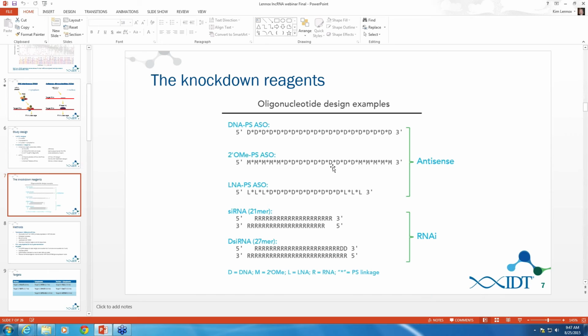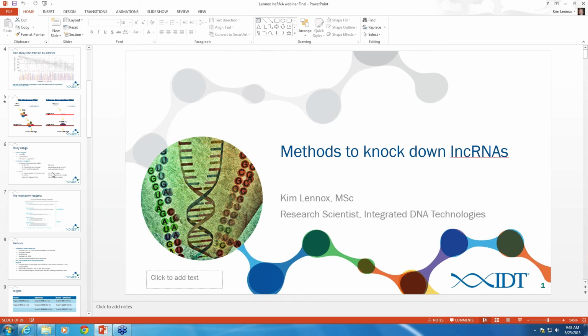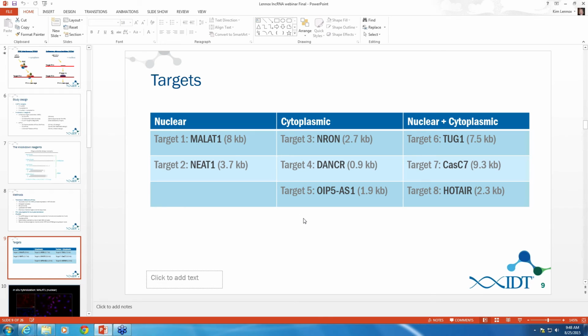Okay. This is an interesting question. So this person is wondering if we have any experience with circular RNAs, and then they have, is it putative microRNA? Sure. So that was one of them that was originally going to be in this study, the one that's the miR-7 sponge, because it's a cytoplasmic non-coding RNA. But we thought that it might confound things a little too much, as now you're adding not only different localizations, but also linear versus circular, and the fact that it binds miR-7, and a whole bunch of proteins. And so for this original study, we did not test a circular non-coding RNA.